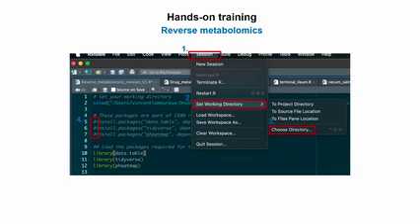So just create a folder on your desktop and call it, I don't know, workshop. Then open that folder and create another folder in it. I just like to keep things separate, right? So create a subfolder that you can call fast search, or whatever you want, and then you drag and drop the 3 tables that you fast searched into that folder. Make sense? So it's just 2 folders, and you put the fast search files into the second one, the subfolder.